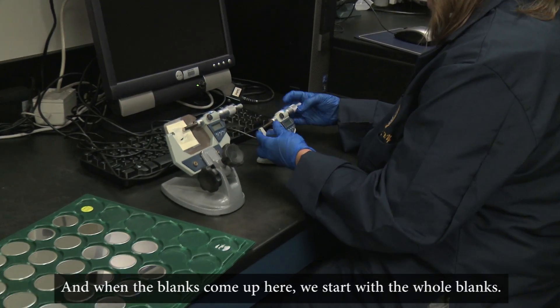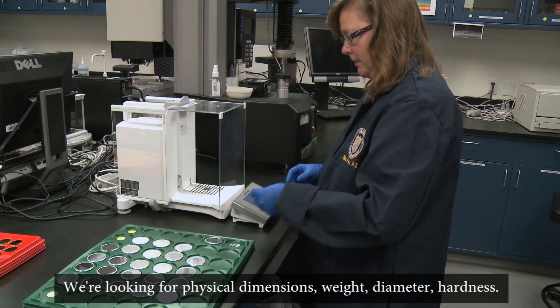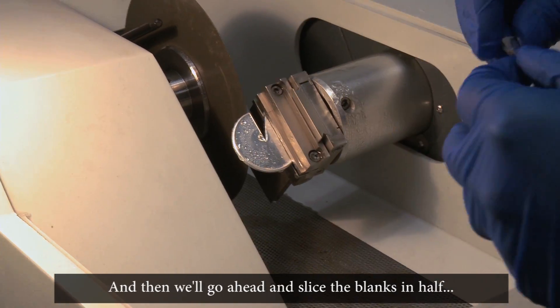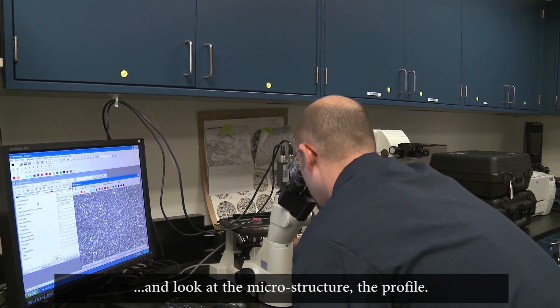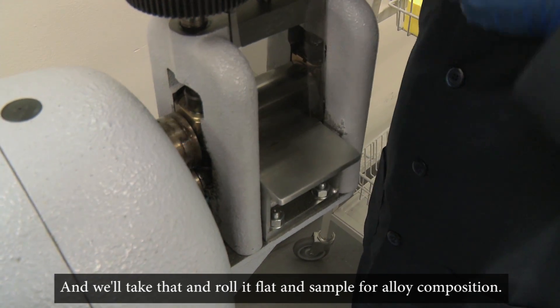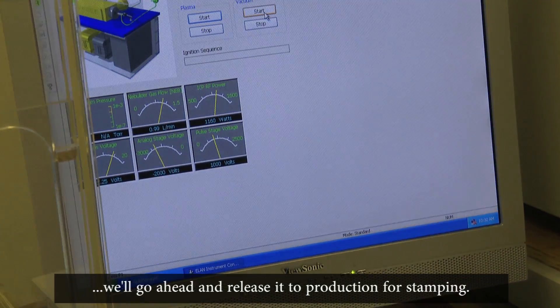When the blanks come up here, we start with the whole blanks and we're looking for physical dimensions: weight, diameter, hardness. Then we'll go ahead and slice the blanks in half and look at the microstructure and the profile. Then we'll actually take that and roll it flat and sample for alloy composition. Once the blanks meet all those parameters, we'll go ahead and release it to production for stamping.